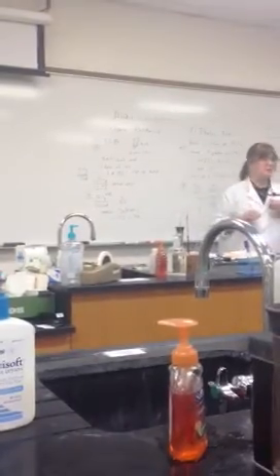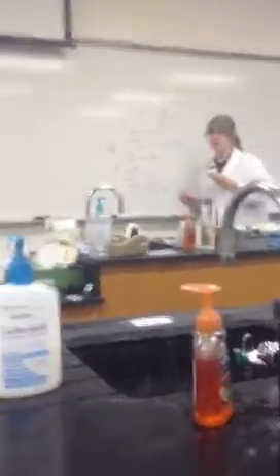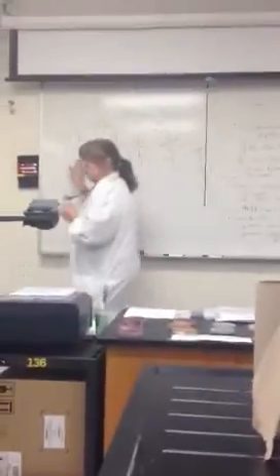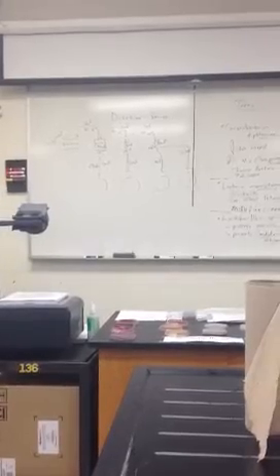It's a lot of information, I understand that. I know it's a lot of unfamiliar information, but let's keep working on it, okay? First one, dilution series. We use milk. It could be apple juice, it could be a Coca-Cola, it could be anything you wanted to check, green beans, blend it up, it could be anything you want to check.